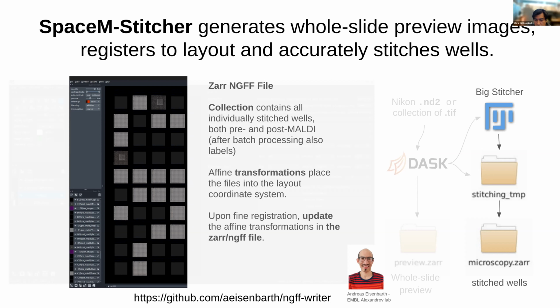Volker, what do you use to open the ND2 files in dask? I will come to that. I use a library by Tally Lambert. I actually have a special thank you slide for Tally Lambert at the end. I mean, he's been basically implementing tons of the features that we use in napari, and he also has a reader that takes ND2 and directly gives you a dask array. So you have the lazy loading. You don't read everything from your ND2 until you need to. Yes, but that hopefully answers the questions.